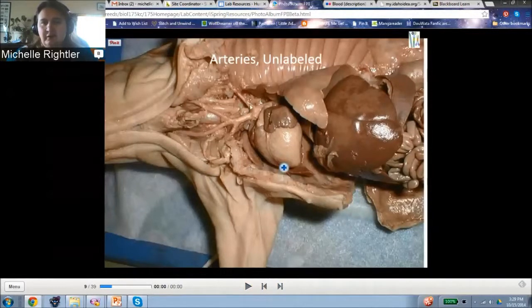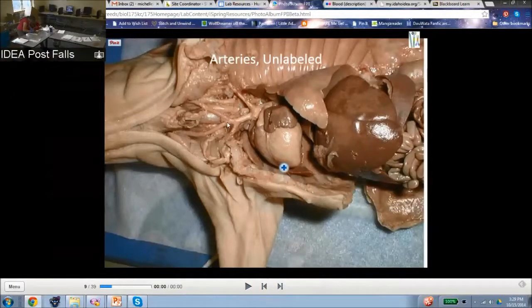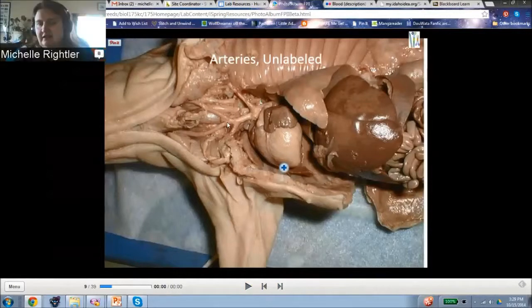This is the subclavian because it goes toward the arm. These are the carotids that go on either side of the trachea. Ours aren't as clean as that — we found them, they're just not as clean. But on quality of dissection, you're going to want to clean that up so that it is really clear.